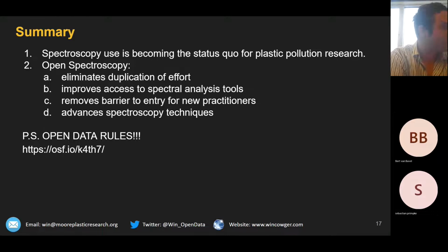Backgrounds are really tricky to remove accurately from the spectral signatures, but definitely the idea with this really big database is that there will be some kind of background variation in the spectra, and because we'll have that in our database, it'll be more robust. Yeah. But do you want to take this contamination out, or do you want to have spectra with contamination in that gives you the right answer? Yeah, but both approaches will work.